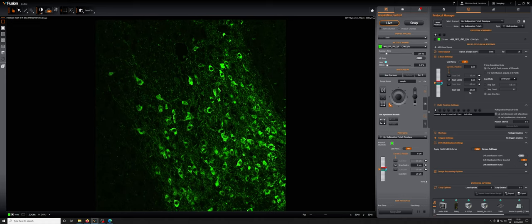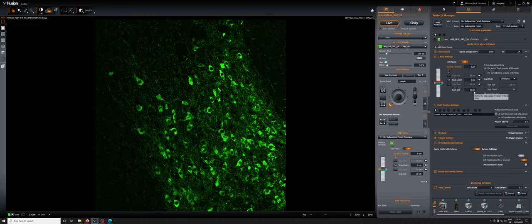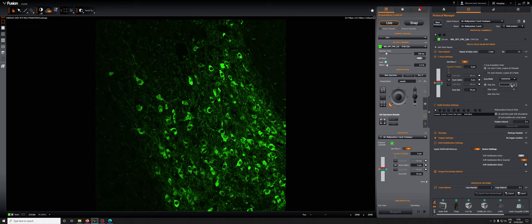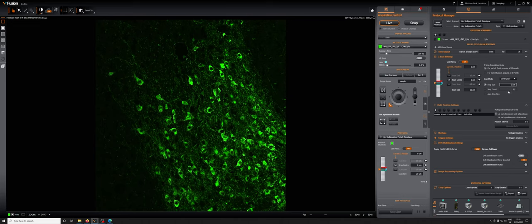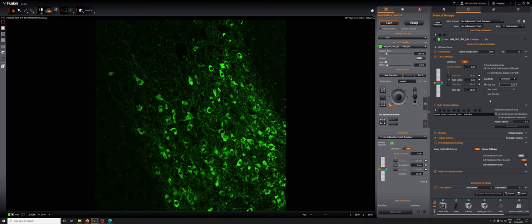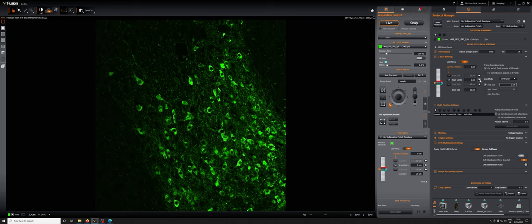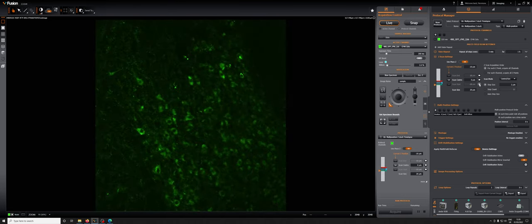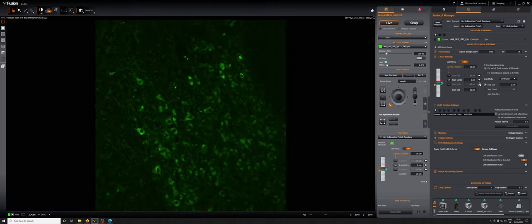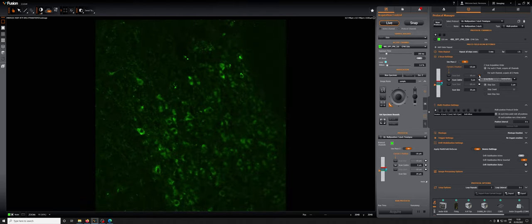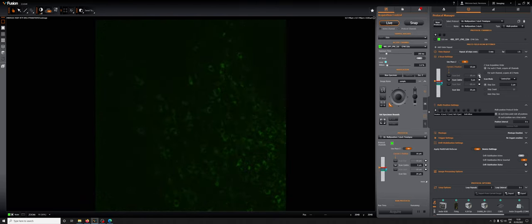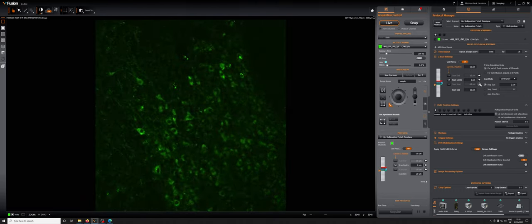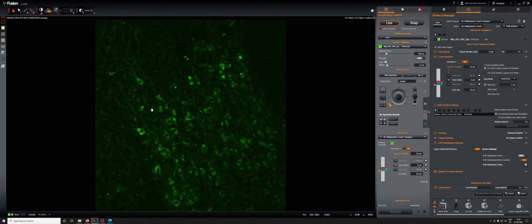I've selected here a scan size of 20, and I'm going to use a step size of 2 for the purposes of this video. I am then going to check that the z-stack seems to be the appropriate size by moving from the center, which is where I am now. You can see our current z position is zero, just to both ends to make sure I capture everything. You can see that when I do this in this particular sample for this particular objective, there are still things here that might be of interest.